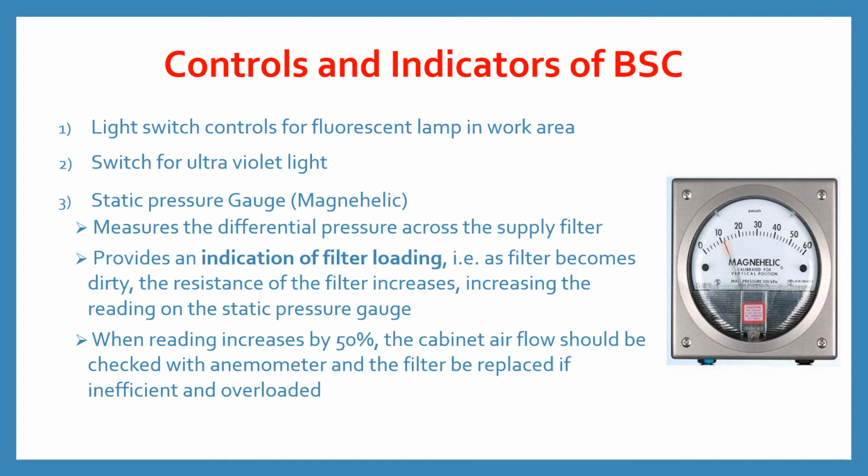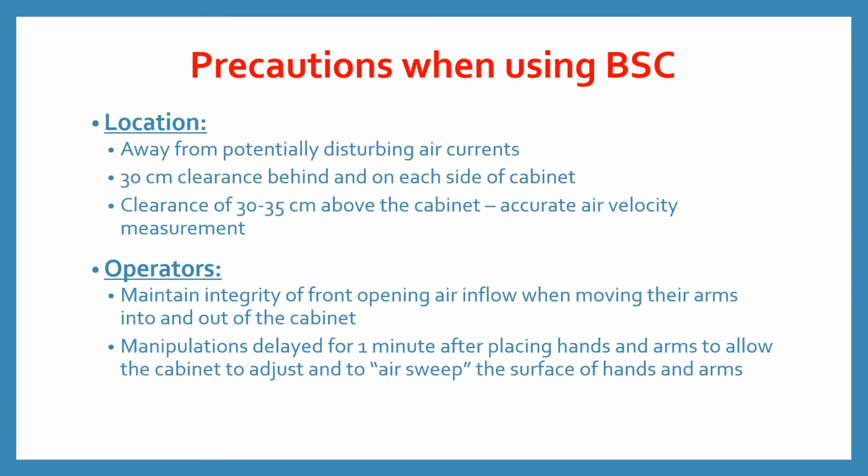That is, as the filter becomes dirty, the resistance of the filter increases, increasing the reading on the static pressure gauge. When the reading increases by 50%, the cabinet airflow should be checked with an anemometer and the filter be replaced if inefficient and overloaded.